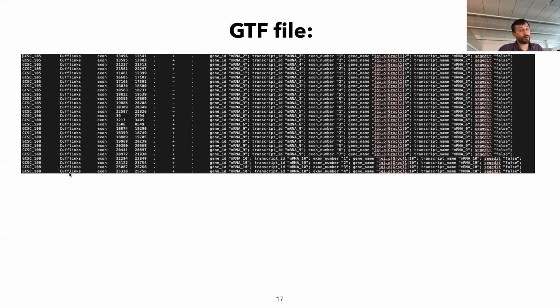So since they're all present, what you should expect to see are what two types of genes? Now, this is a complicated question, but think about how we prepared the pipeline. What two types of genes are you going to expect to see in your expression table at the end when your pipeline finishes?